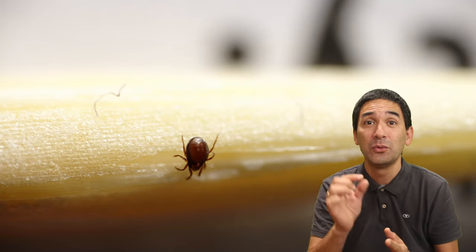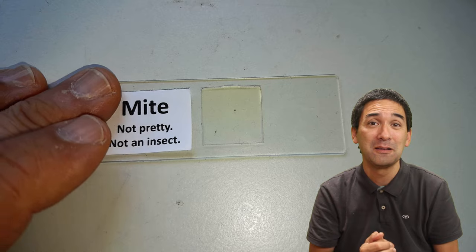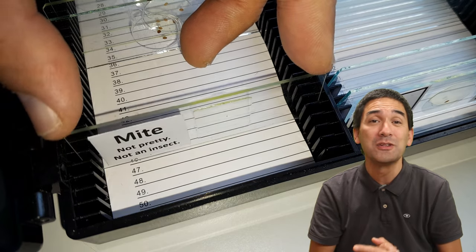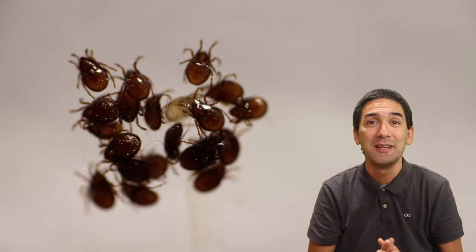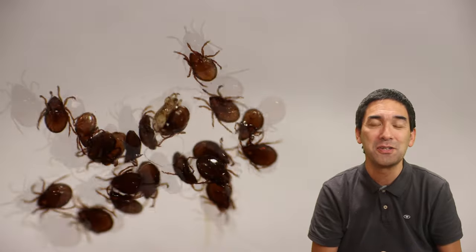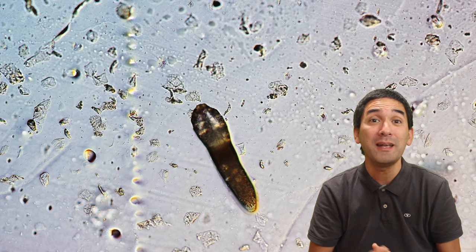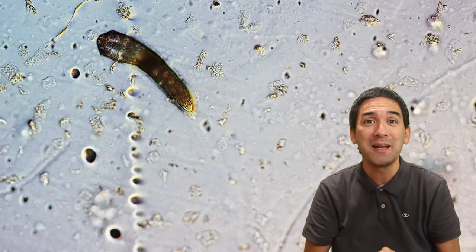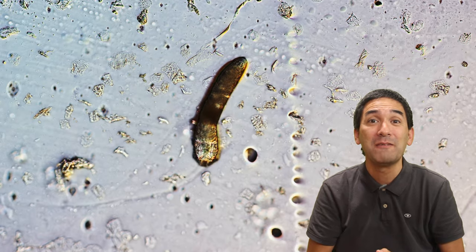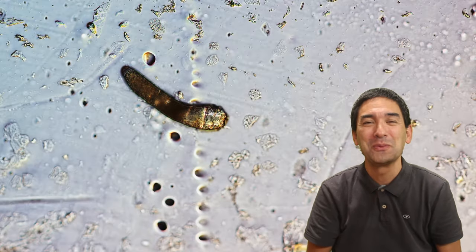Those mites here, I think, are maybe not that pretty — they look a little bit scary sometimes. But with over 48,000 different species of mites that have been characterized, they are nevertheless a very fascinating group of animals. And if you're interested in mites that can actually be found on your skin, this here is a face mite — Demodex face mites are a very common specimen that can be found pretty much on everybody's face, and I have another video for you on that. Happy microbe hunting as always, and see you around next time.